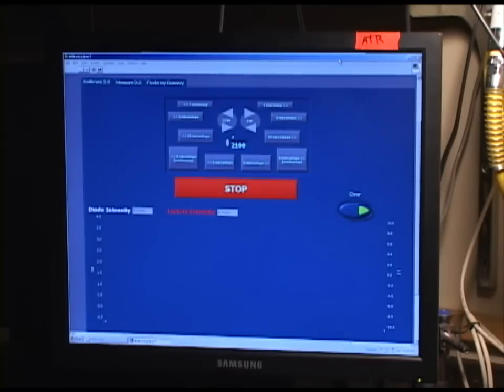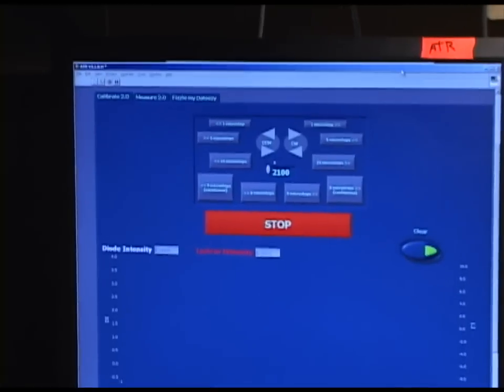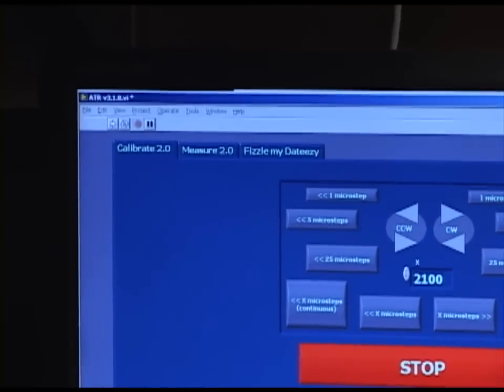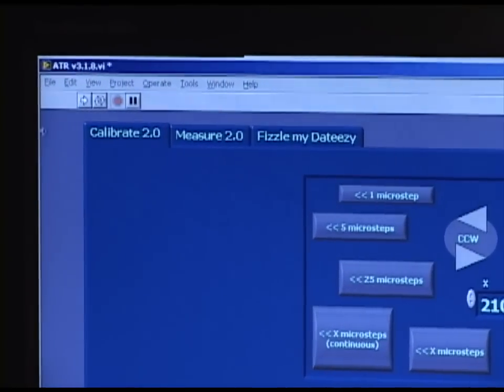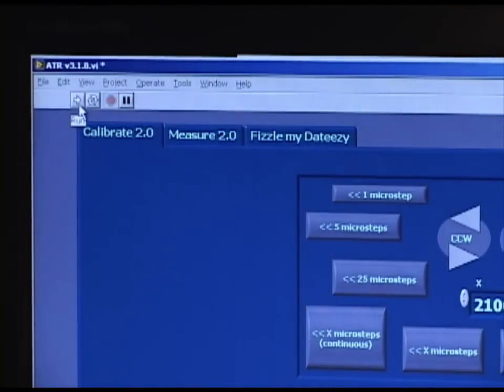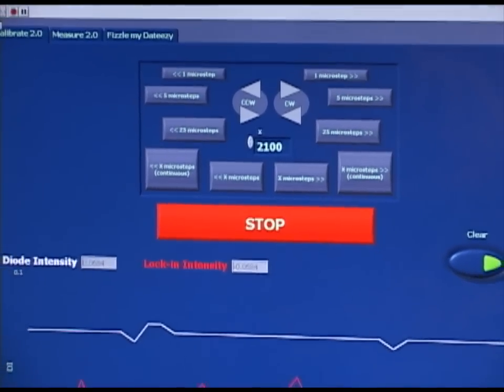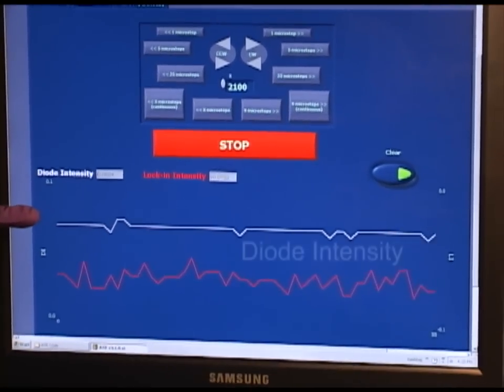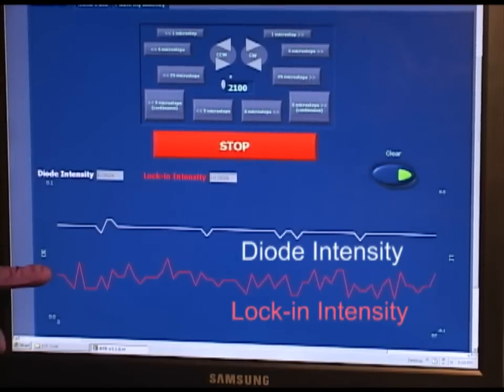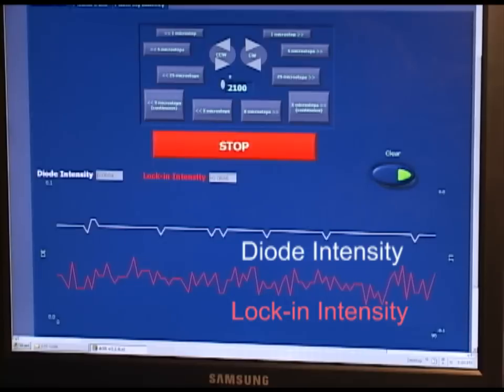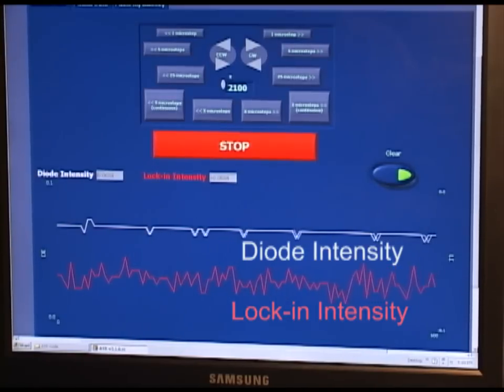Once the sample is aligned and we have a proper wet spot and the electrodes are connected to the leads, we then want to calibrate the instrument to this particular sample to achieve maximum signal and get the most accurate reading of R33. To do this, we select the calibrate tab and click the run button in the upper left hand corner. Once running, the program will display two lines. The first is the diode intensity coming from the detector. The second is the lock-in intensity, the electrical signal coming from the wire leads from the lock-in amplifier.